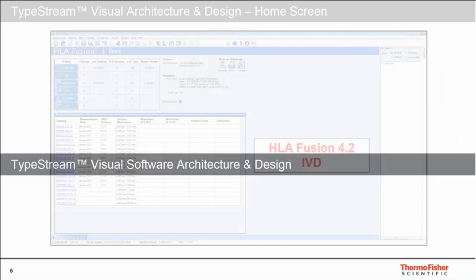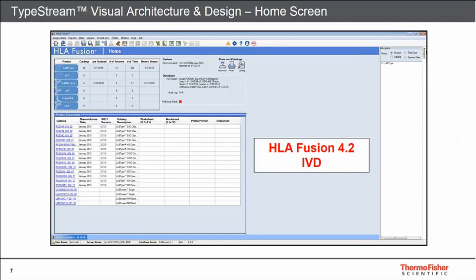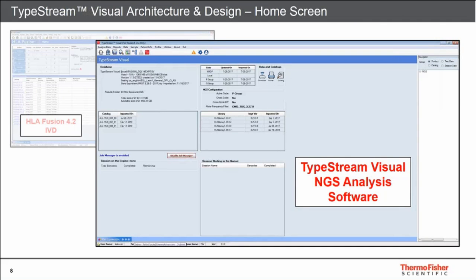Many of you in your lab may currently be using HLA Fusion for other OneLambda products or applications. The screenshot I'm showing here is from the homepage of HLA Fusion 4.2 IVD. If I now overlay a screenshot of the home screen from TypeStream Visual, you'll notice that the look and feel, at least of the home screen, is very similar. TypeStream Visual from an architecture and design standpoint is really based largely on the HLA Fusion architecture, which has been in the field for many years.